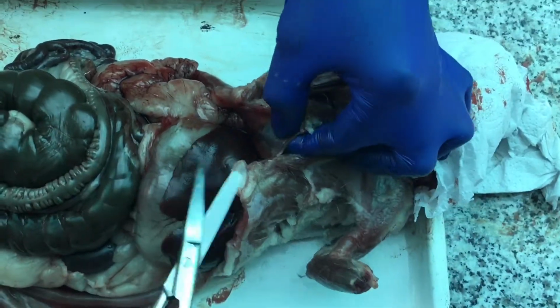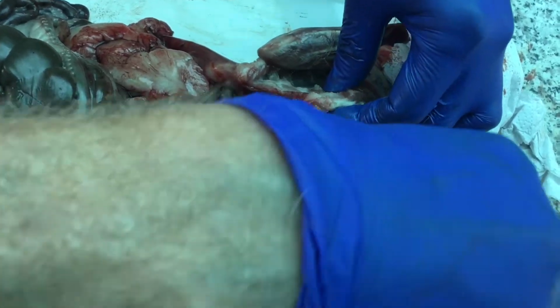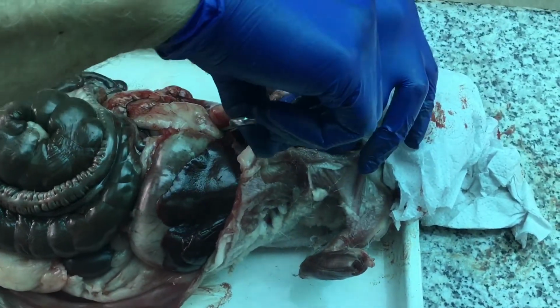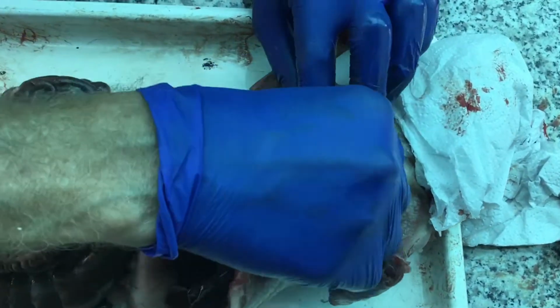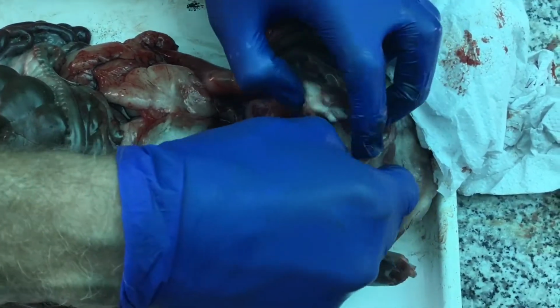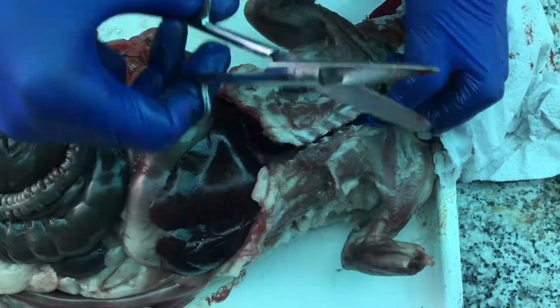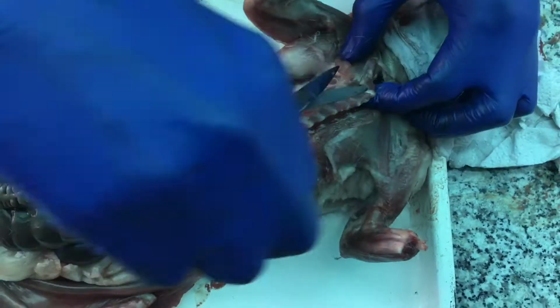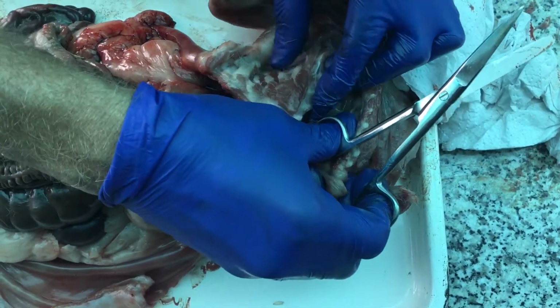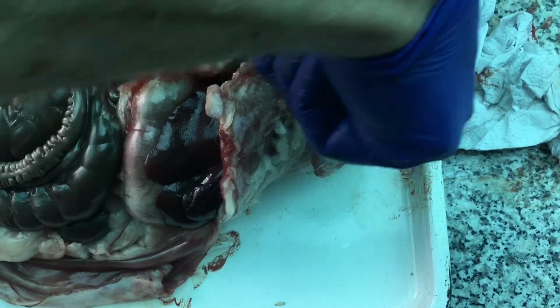See, the diaphragm is a thin piece of muscle. I've got it held in between my gloved fingers, and I'm cutting it away from the undersurface of the ribs on this side so that we can then look inside the chest cavity. And what I'm going to do is cut as far forward as I can, and then again sort of make a flap off to the side. Of course, I have the upper limb to contend with here as well, but if I cut off to the side here and kind of break the ribs back, you'll be able to see pretty well into the chest cavity.